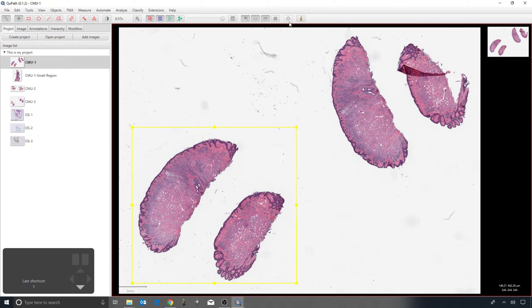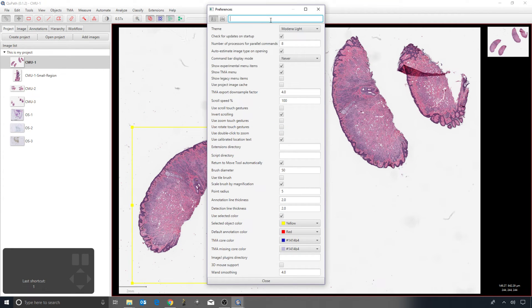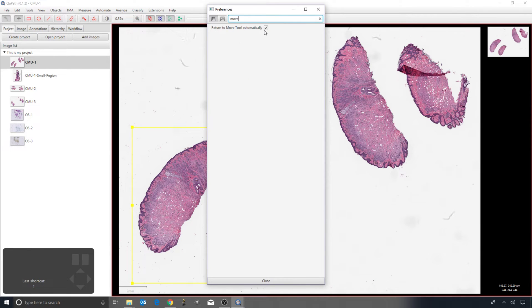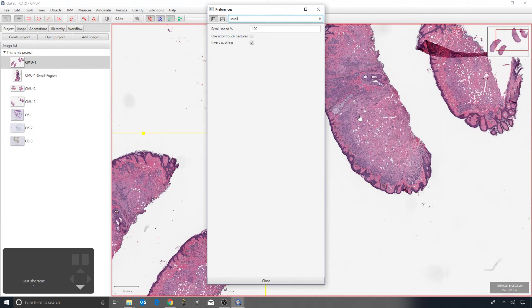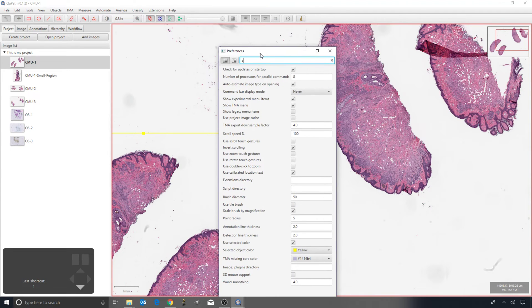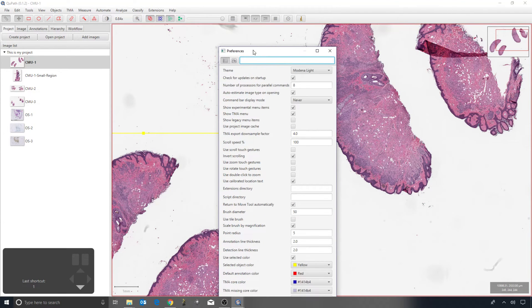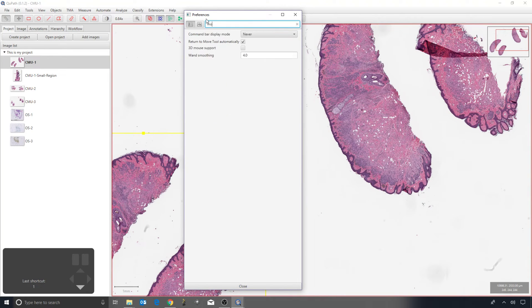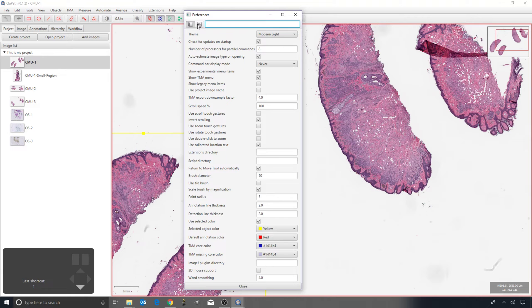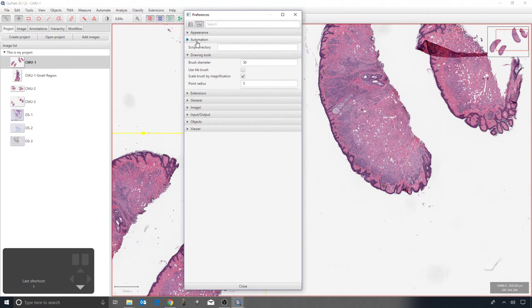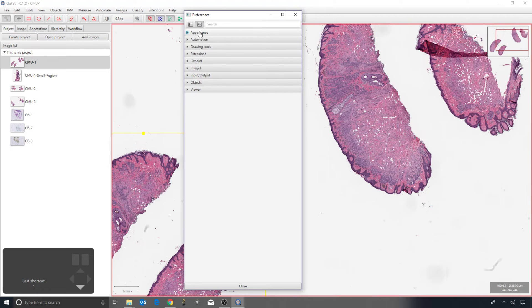At the other end of the toolbar there's a little cog for preferences. I can type 'move' to find and turn on or off that auto-switch option. There are also lots of other customizations — for example, if the scroll wheel zooms in the opposite direction to what you'd expect, there's an invert scrolling option. You can search for settings at the top or click the button beside it for a more organized view of all available options.